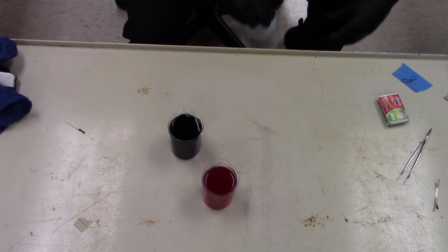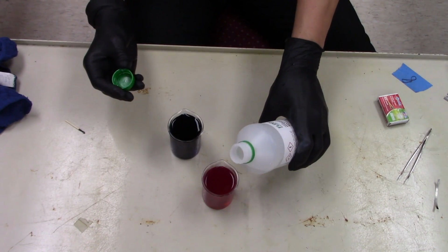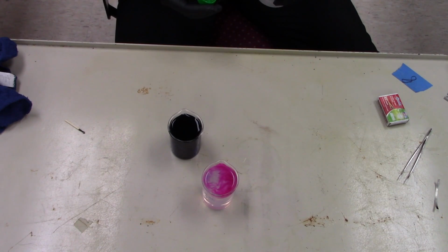Are you about to explode? No, it was the phenolphthalein stuff again. So this is just hydrochloric acid, which you don't want to drink either. There we go. Goes back.